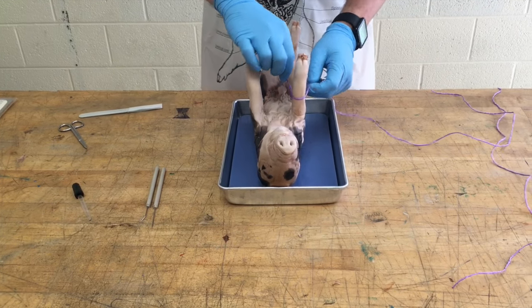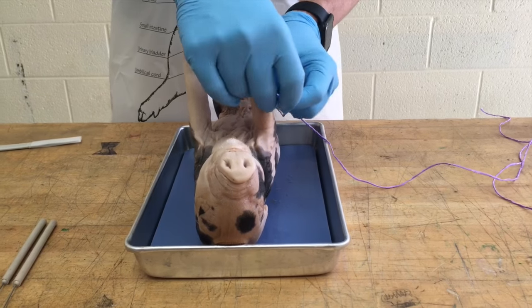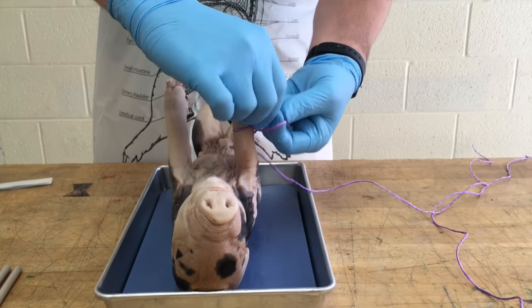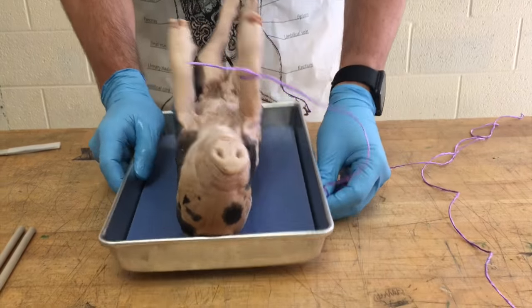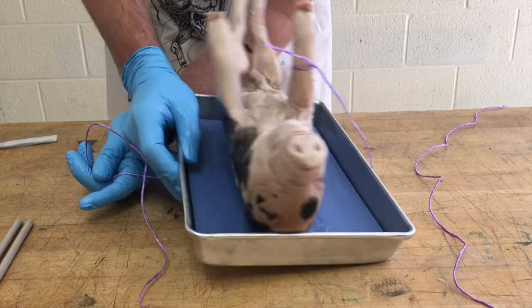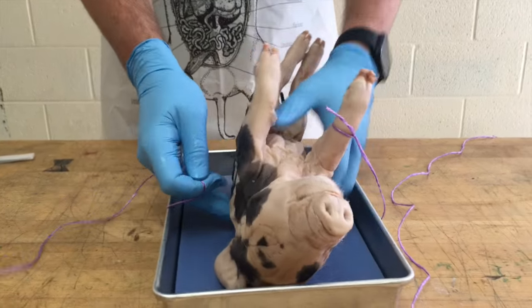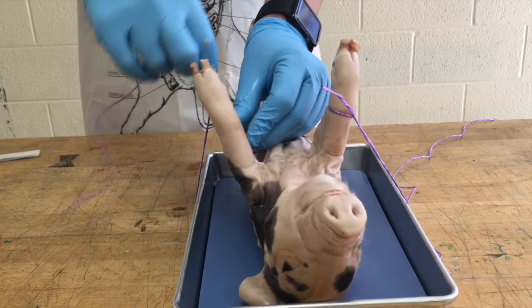We want to tie a knot around the first forelimb so that it's tight. Get it as tight as you can, and then once you get that first knot tied, run the string under the pan. This is important because if you don't, your dissection is going to be a little bit tougher.